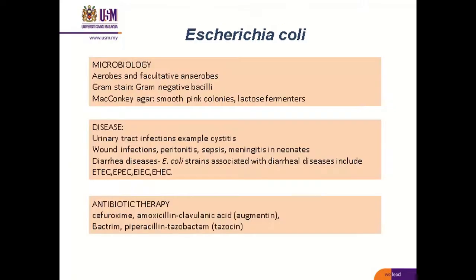In microbiology, it is aerobic and a facultative anaerobe. Gram stain shows gram-negative bacilli, and on MacConkey agar it forms smooth pink colonies, a lactose fermenter.